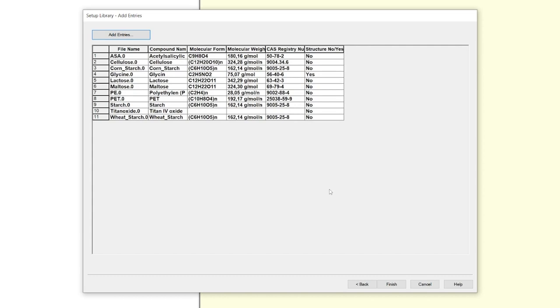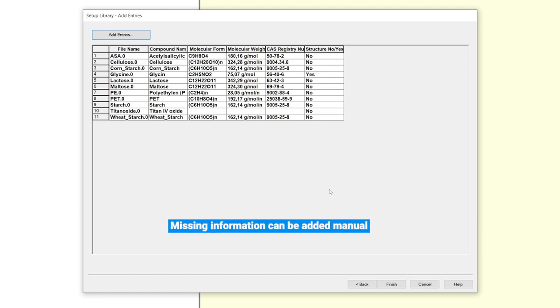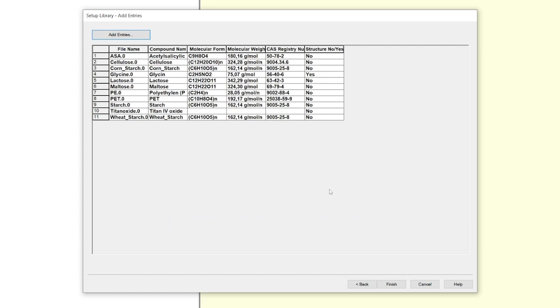All information you asked for in the information mask that is previously attached to your spectra in the info box will be automatically written in the table. You can edit them if you want. All missing information can be added manually. If the cell for the compound name is empty when you press finish, you will get an error warning and the whole spectrum will be ignored for your library.